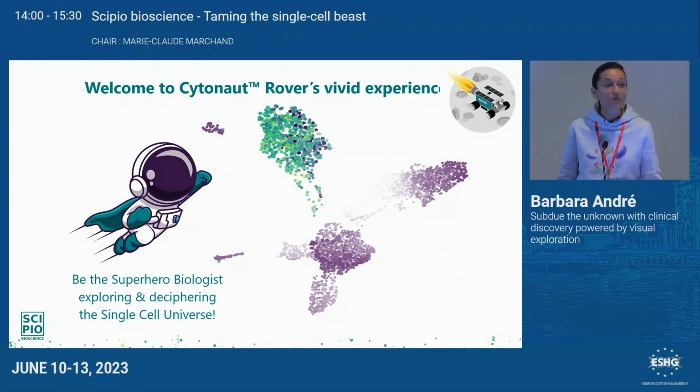So it's now time to board on Rover for true. Rover, which is the data visualization module of Cytonaut. This will be a vivid experience where you are the superhero biologist empowered to explore and decipher the single-cell universe.